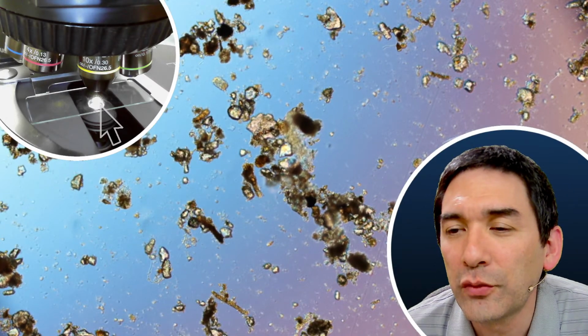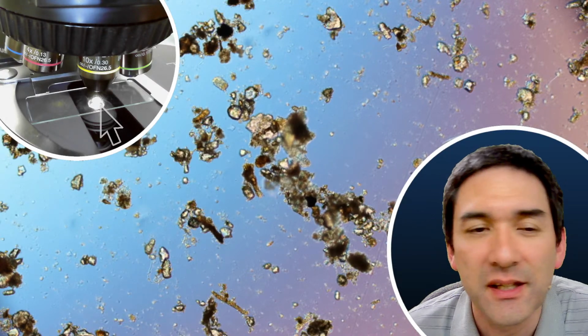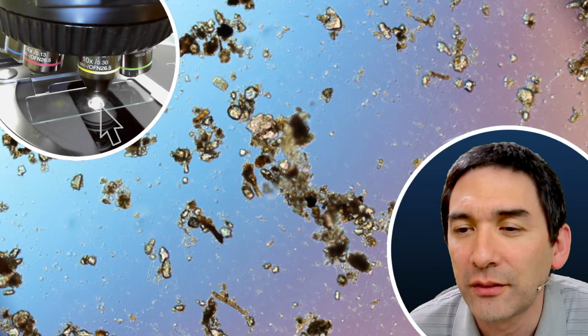It's cool that tardigrades and rotifers at around 1,000 cells each can be about the same size as some ciliates. I also consider this kind of fascinating.